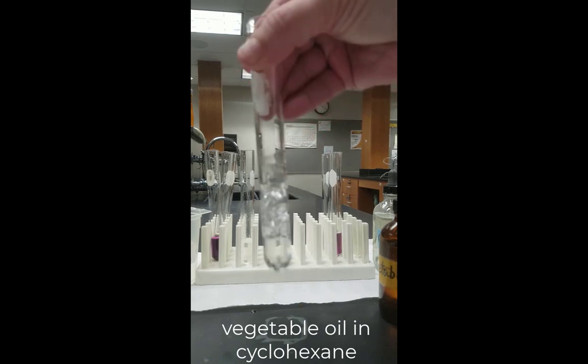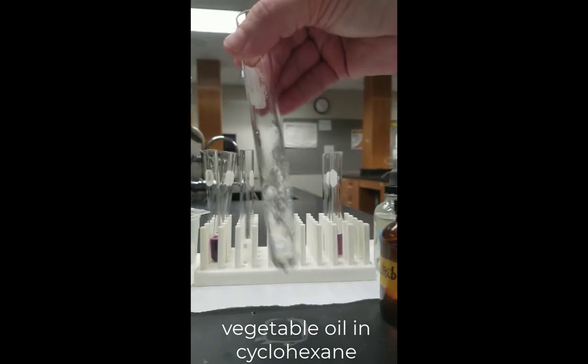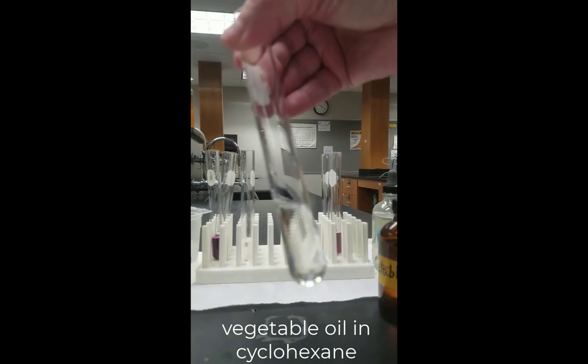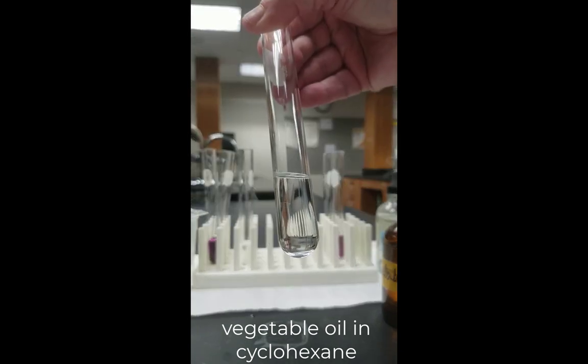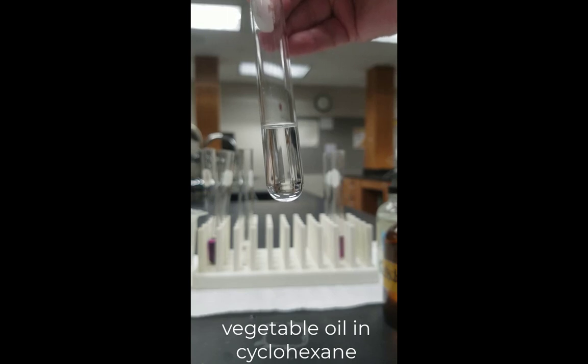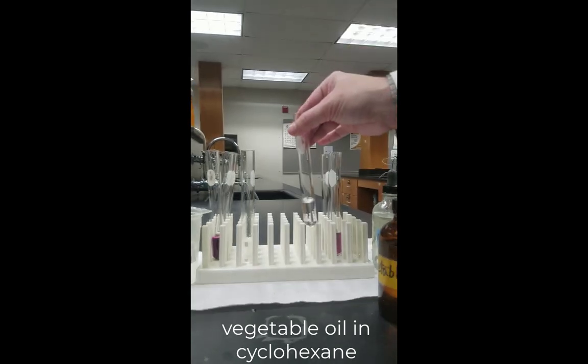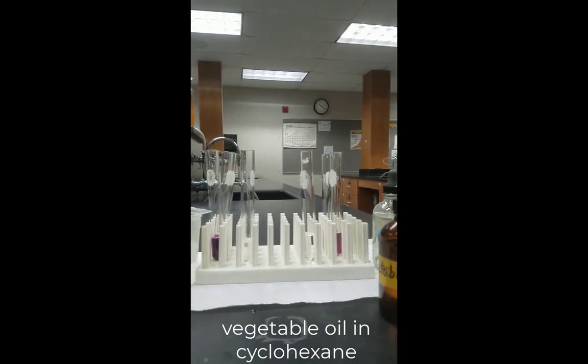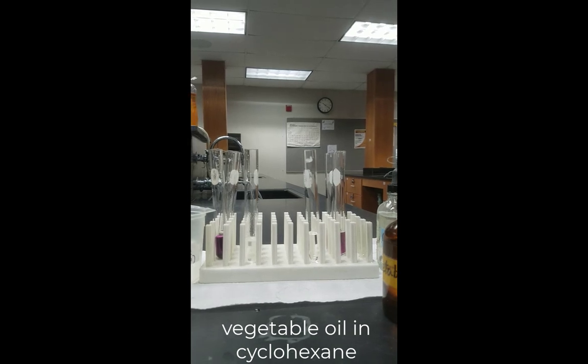Now, agitating the vegetable oil in the cyclohexane, you'll notice it has a considerably different kind of a texture and behavior than it did for water. You don't see any tiny bubbles. You don't see two layers. It's one nice homogeneous solution. Everything is completely mixed in.